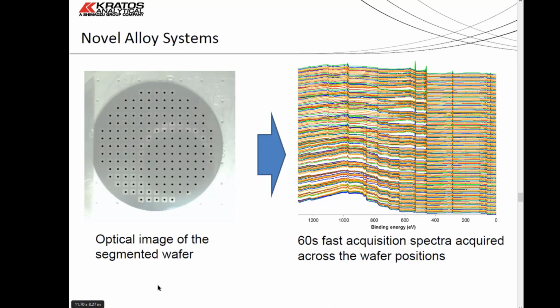These weren't actually to be looked at for titanium and cobalt distribution in particular, but mainly for doing lots of different experiments on the same material concentrations. They had boxes and crates of these different ones, deposited for different amounts of time. They didn't believe there was necessarily a distribution across the wafer.